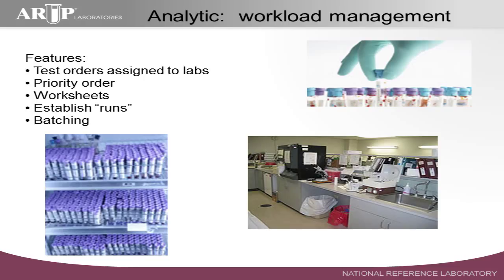Okay, now moving on to the analytics side of the functionality. It's more about workload management. So now you have all these specimens flowing into the lab. What do you do with all of them? Well, it would be nice if you could just pick one out at a time and say, I'm just going to do this one and go work on it. And when I'm done with that one, I'll pick up the next one. Of course, that's not how it's done in today's laboratories.